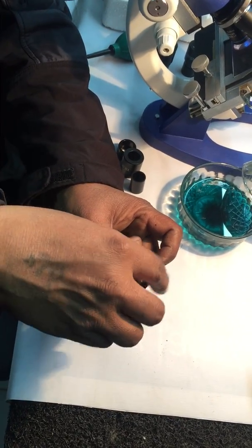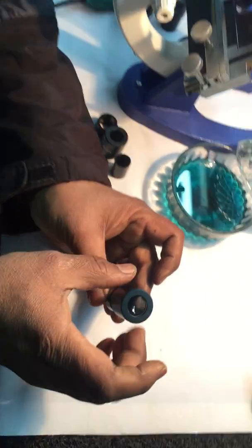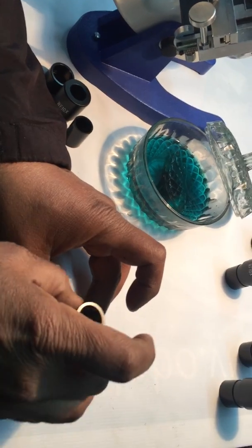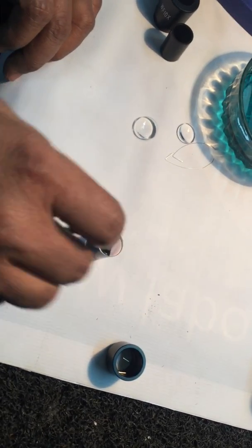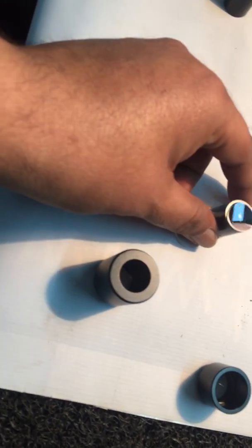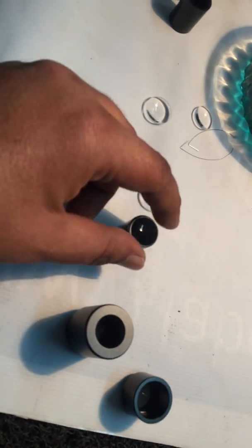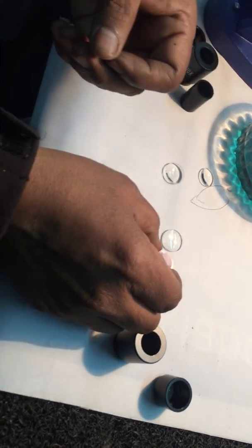We will show you the process of cleaning of WF 10X eyepiece IPs. This is the lower part. This is the spacer. You have the field lens. The flat side — one side is flat and one side is the back side.